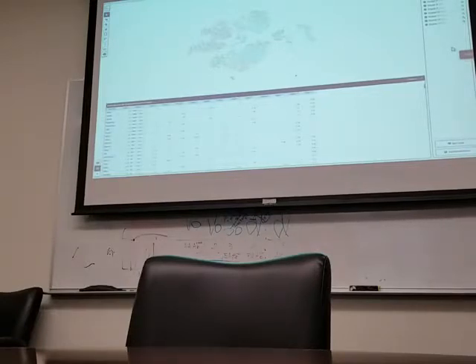So in terms of incorporating that data into this, I haven't done it yet. We should be able to import the files into there. What I started to do, I was hoping to have it done by now, but it's not quite.